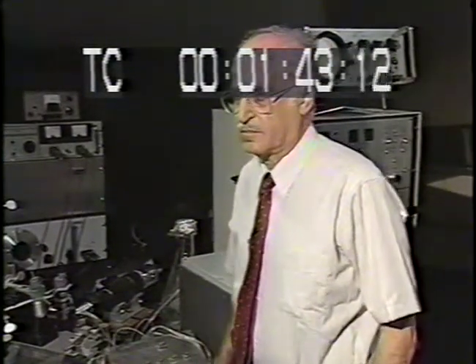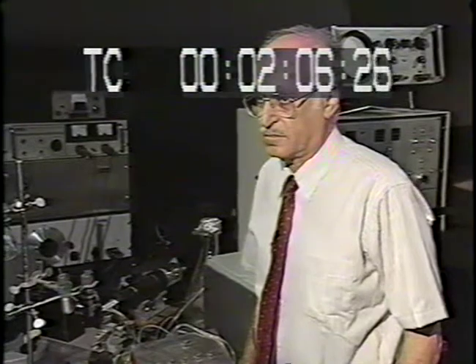Friday morning, June 28, 1991. We are on the first floor of the biomedical building on the campus of Brown University, talking with Dr. Boris Rotman about the history of the cell sorter. Dr. Rotman, you have kept a very rare prototype version of the cell sorter cell analyzer that was developed at Los Alamos. How did you acquire it, and how did it get to Brown?